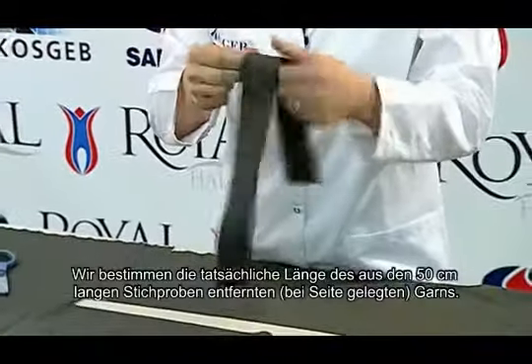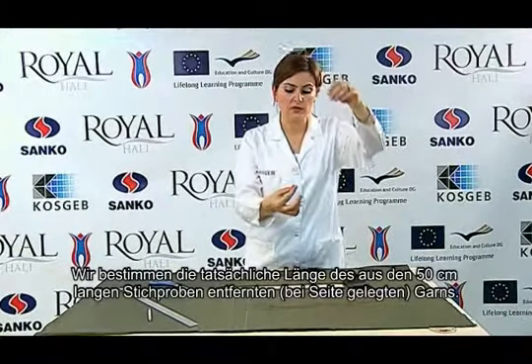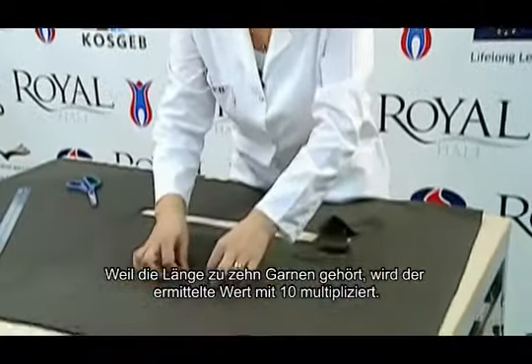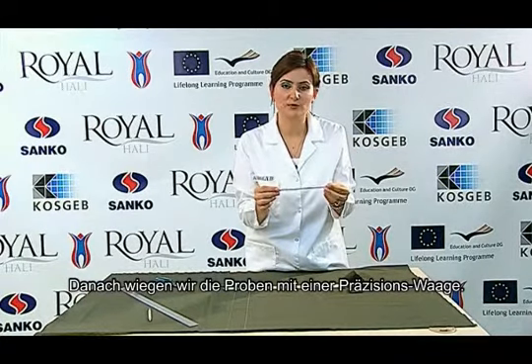We find the actual length of the yarn that is removed from the 50 centimeter long sample. Since the length belongs to 10 yarns, the obtained value is multiplied by 10. Then we weigh it in a precise balance.